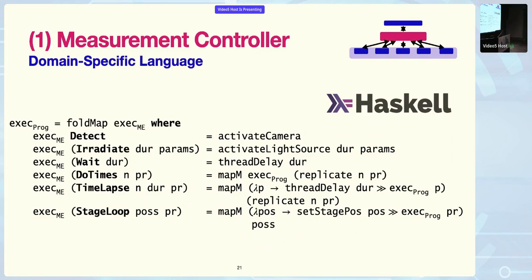Yeah, thank you for your question. I think it's a good question. It's always a difficult trade-off between having a domain-specific language, which remains domain-specific, and something that can be applied to different domains. So I believe that it can be used for different microscopy techniques because the principles are similar. We will maybe have to add stuff. I don't know if it's nice to also do it in, for instance, 3D printing, because then it's a different application domain. And maybe it's nice that we don't also change the syntax, sometimes the behavior. So I think that we want to have a domain-specific language and to have it remain domain-specific, which is in this case fluorescence microscopy. Thank you.